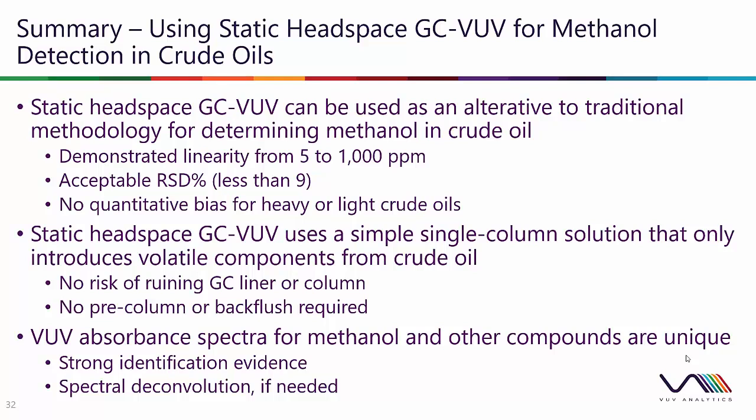Now, those of you may be thinking out there, what if you just used FID instead of VUV? Well, sure, that could be done, but I would really like to highlight an important feature, which is that VUV can easily discern a lot of these different peaks in the headspace chromatogram besides just the methanol. So if, let's say, there was a coelution, we have a much better chance of deconvolving that type of risk versus an FID detector.